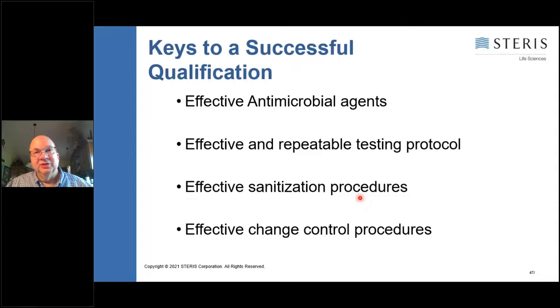We'll talk about that. And if anything changes in your clean room facility, you need to see how that will affect your coupon testing. For example, a new shift of operators, new flooring brought in by Stonhard, new wall paneling, any type of new material brought in, or you're adding a couple of extra shifts. How does this affect the flora from your environmental monitoring and data trending? Do you see new microbes, new organisms that you might want to include in your coupon studies?